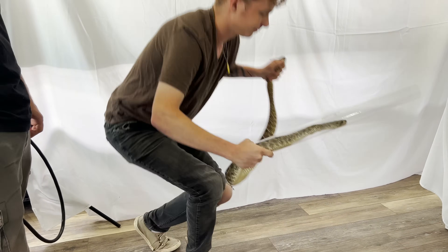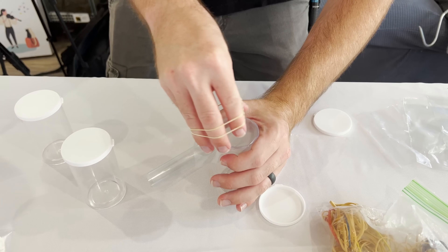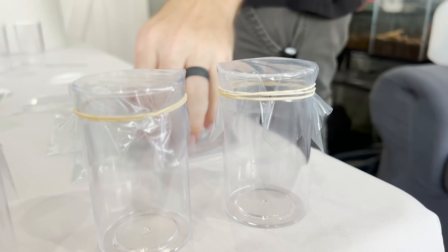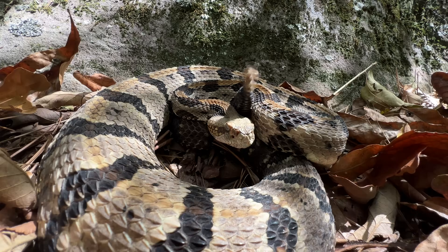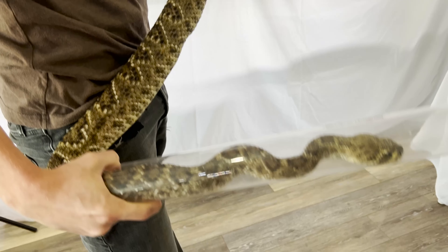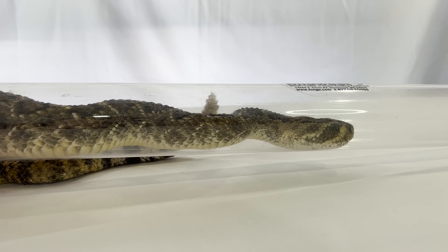We're going to reorient and get our venom table set up to actually get the venom. We have state-of-the-art technology here — some vials with plastic wrap and rubber bands over them. The idea is these form a simple membrane that functions not unlike the skin of a prey item or an attacker. When a snake bites you, they feel their fangs go under your skin, and that stimulus encourages them to pump venom in. This snake is stressed out and will very readily bite, so the hope is we can get it to latch onto one of these containers and pump it full of venom for our experiment.